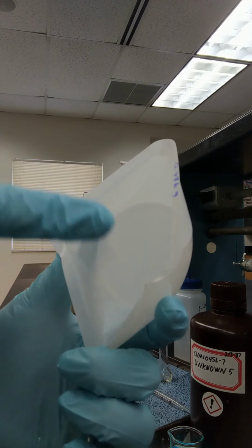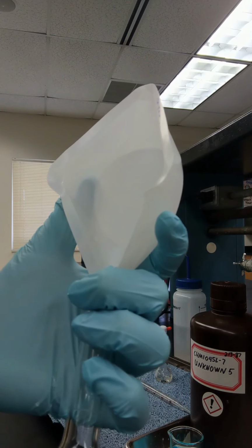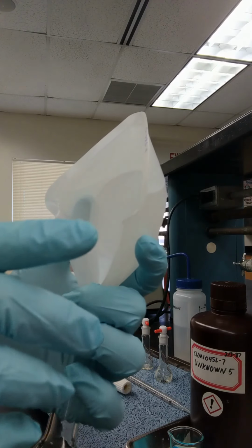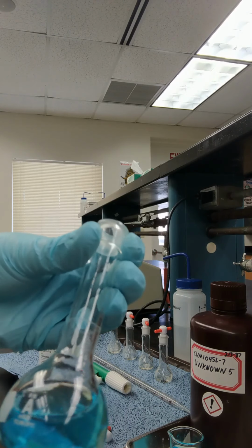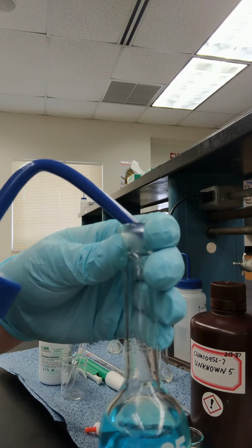I have rinsed all the solid, everything was transferred to the volumetric flask. So the next thing that I'm going to do, I'm going to add some more water.